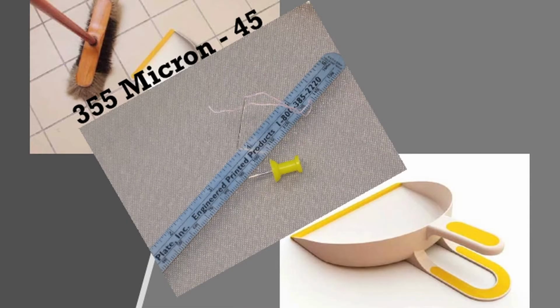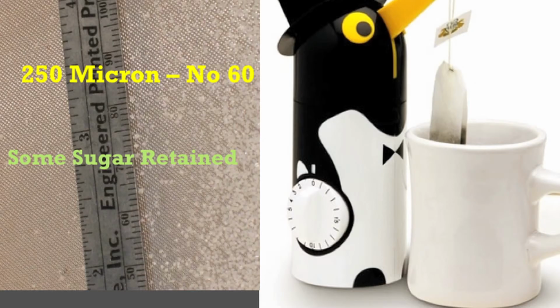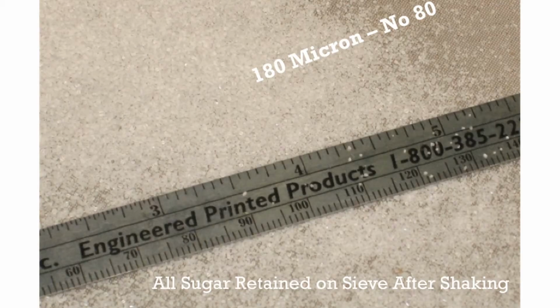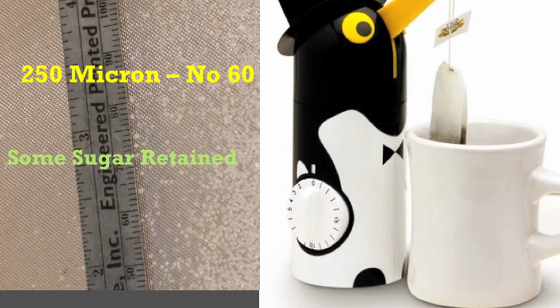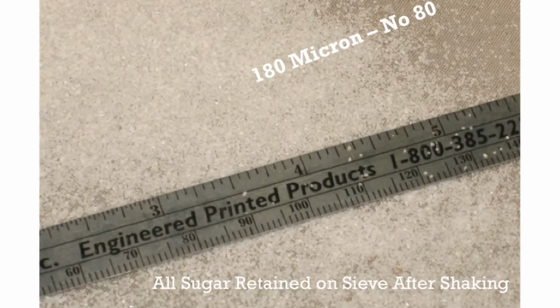Next, we test some sugar using 3 mesh sizes: 355 microns, 250 microns, and 180 microns. We find that all the sugar goes through the number 45 or 355 micron sieve. Some of it passed through the number 60 or 250 micron sieve, while some stayed on the surface. None of the sugar that went through the 60 sieve passed through the holes in the number 80 sieve.